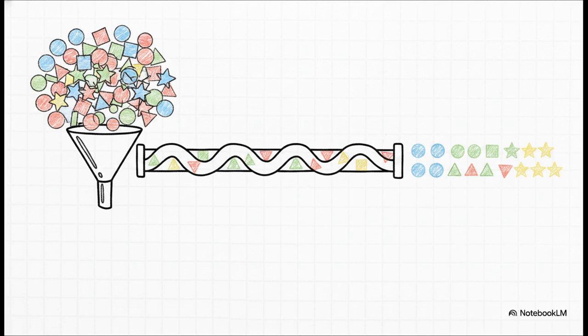Well, in the real world, whether you're looking at biological or environmental samples, they're almost never pure. They're massive, messy, complex mixtures. If you let them all rush into the mass spec at once, your resulting spectrum would just be this overlapping, completely unreadable mess. Enter the chromatographer.